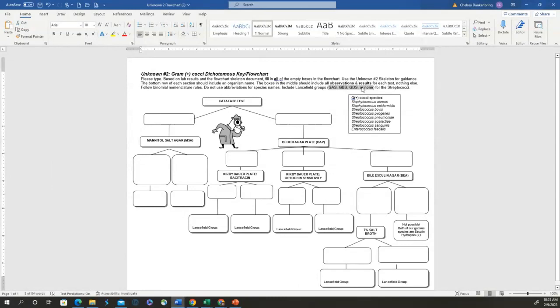Do not write NA. NA means you're saying that Lancefield groups aren't applicable. Well, if it's there, it is applicable. Okay, so do not put NA. You could put the word none. And again, all of this is in the videos, but I just want to point that out because this is something a lot of people overlook.